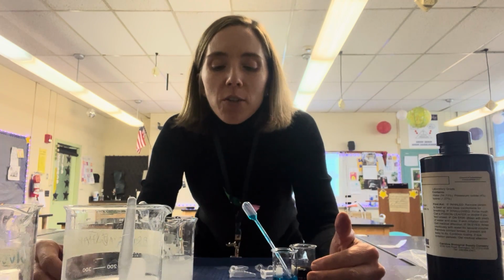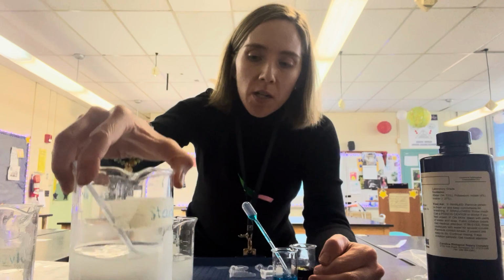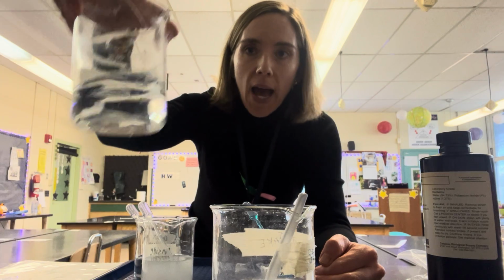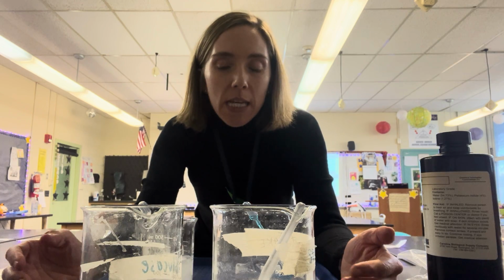Everybody. Today I want to walk you through the investigation that we did to see how we can simulate what happens to food molecules in the small intestine. We used a solution of two different types of food molecules. We had starch in water, which is a complex carbohydrate, often found in a lot of the foods that we eat. And we also had glucose in water. Remember, glucose is also a carbohydrate. It's simpler. It is sugar, essentially.